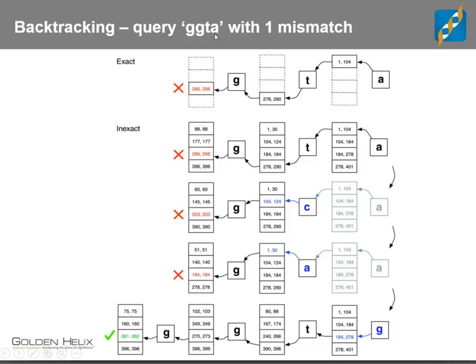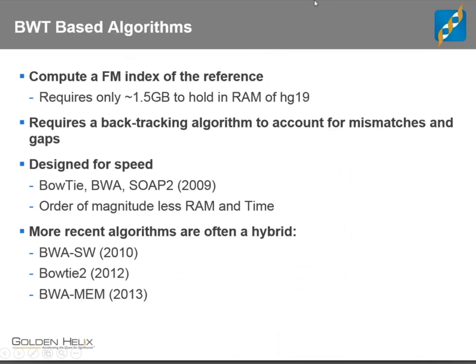Okay, well, we back up one more letter, replace the first letter from an A to a G, now go down the tree with a TGG, and the rest of the string matches, and we find a match with a single mismatch. As you can imagine, this is computationally intensive, but believe it or not, it's actually so much faster than pretty much any other approach. And so the first class of algorithms that use this computed what's called the FM index, which is that tree-based structure, along with the ability to go and find where in the genome those places are that we just found.